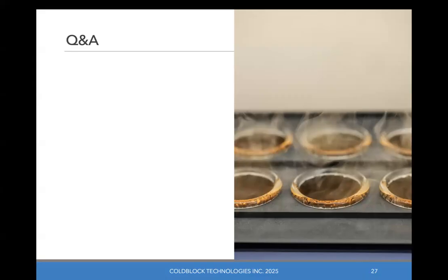The next question is, what is different about your method that allows for accurate mercury recovery? Thank you. So 3050B is designed really for metals that are stable during heating in nitric and hydrochloric acids. It's traditionally done in open vessels like hot blocks or heating plates. Mercury behaves differently than most metals, and volatility is the big issue. When heated in nitric or hydrochloric acid, mercury forms species like elemental mercury or volatile chlorides that are highly volatile and can escape into the air.